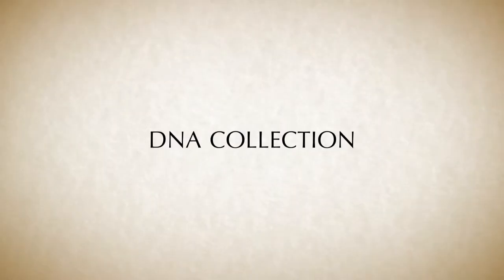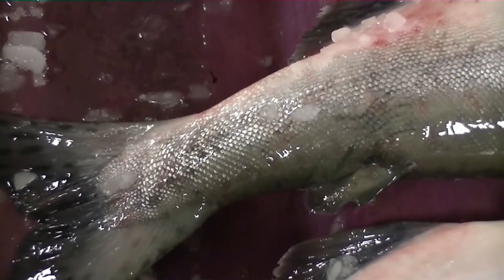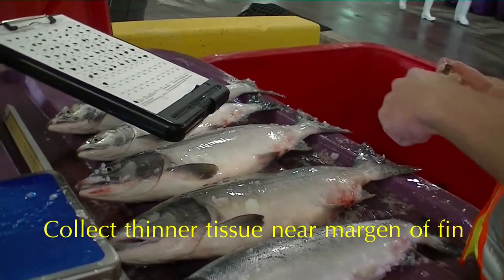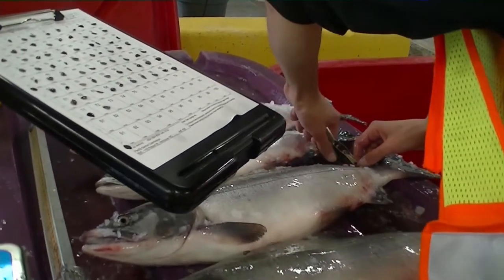The final sampling component is collection of a DNA tissue sample. DNA is collected using a hole punch to remove a small disk of tissue from the margin of the adipose fin. Thinner tissue is best because it preserves better and the sample does not need to fill the entire hole punch. If the adipose fin is missing, take the sample from the caudal fin instead.